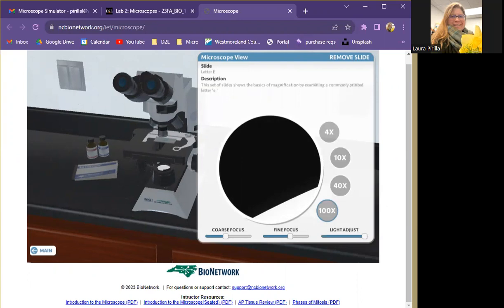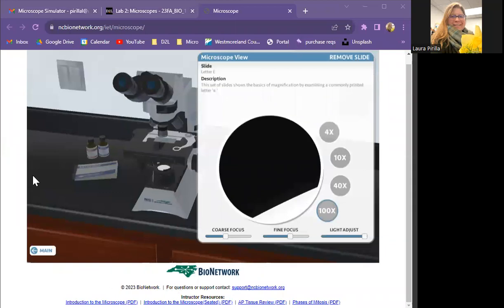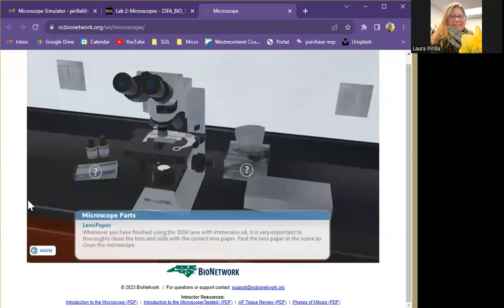All right, so now that we've looked at it under all of these, when you visualize the letter E slide, click on Remove Slide. So I'm going to click this Remove Slide button here. All right, now it says, because you finished using the oil immersion slide, I'm sorry, I can't talk today. Now that you're done using the oil immersion lens, you need to wipe that oil off of the lens and clean it because it'll gunk it up and get nasty.